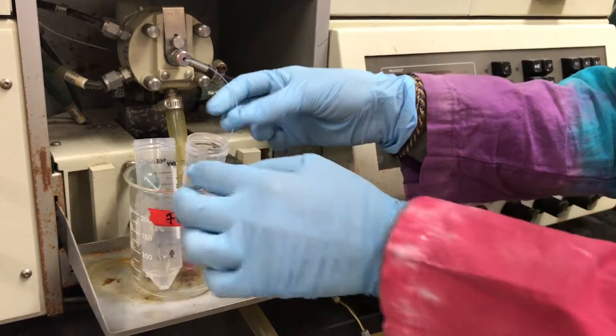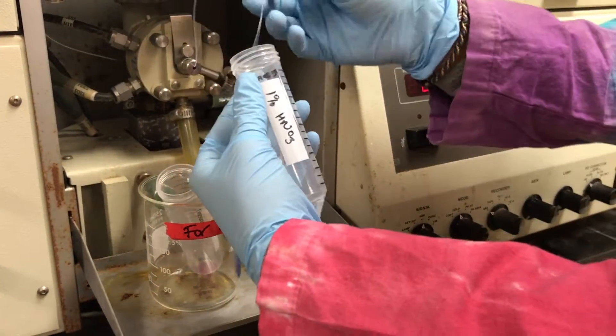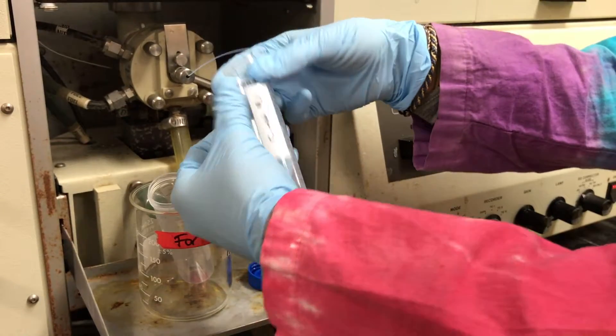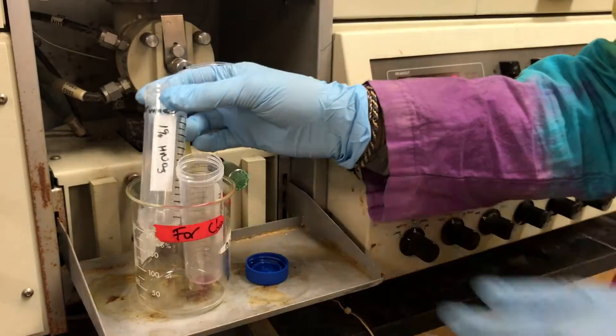To change samples, remove the tube from your first sample, and be sure to flush the system with 1% nitric acid. After that, you're ready to run your second sample.